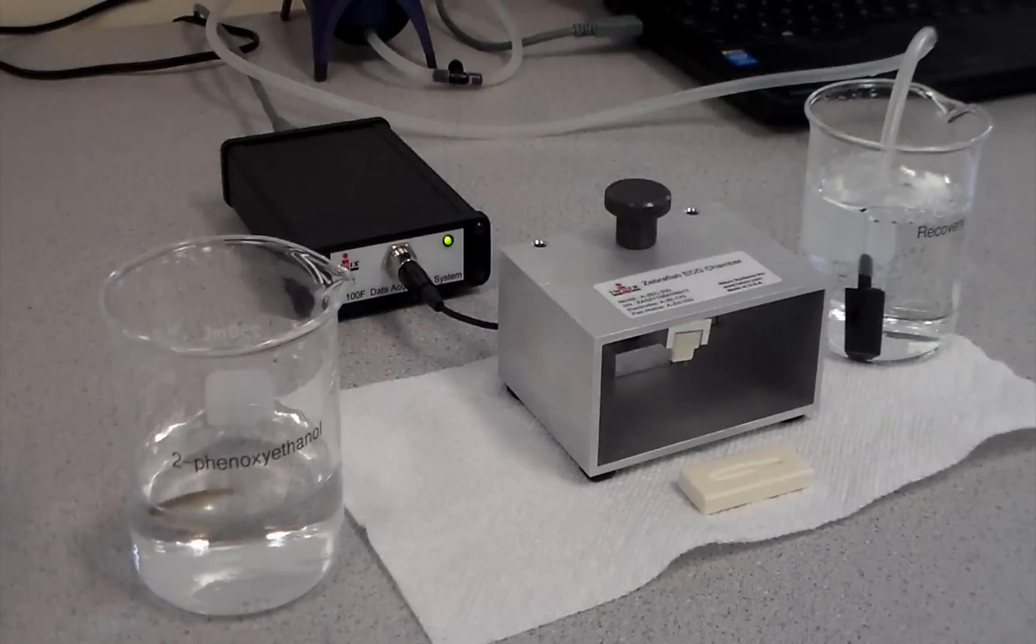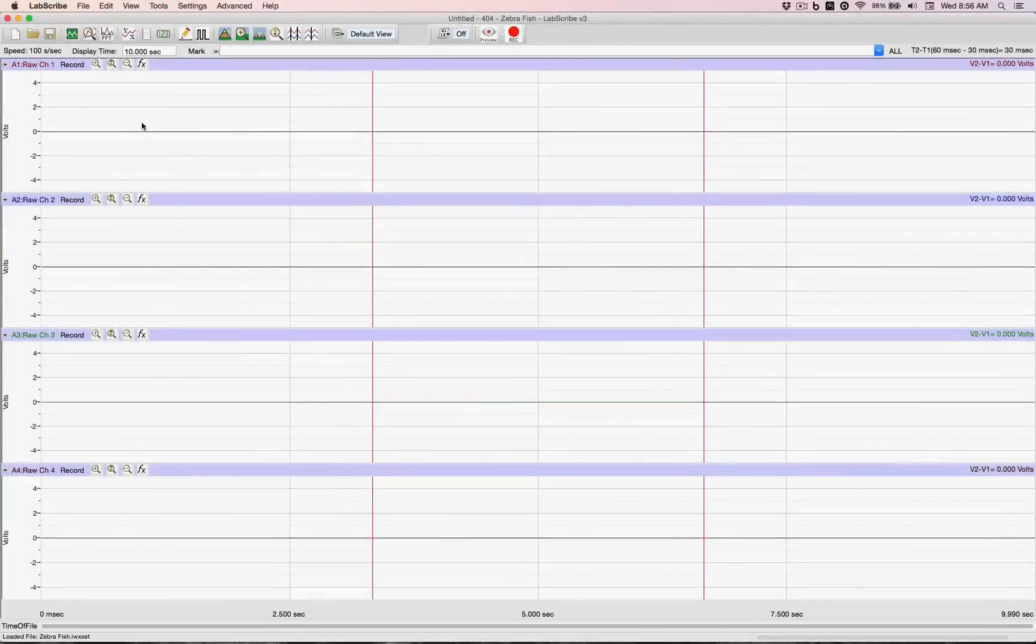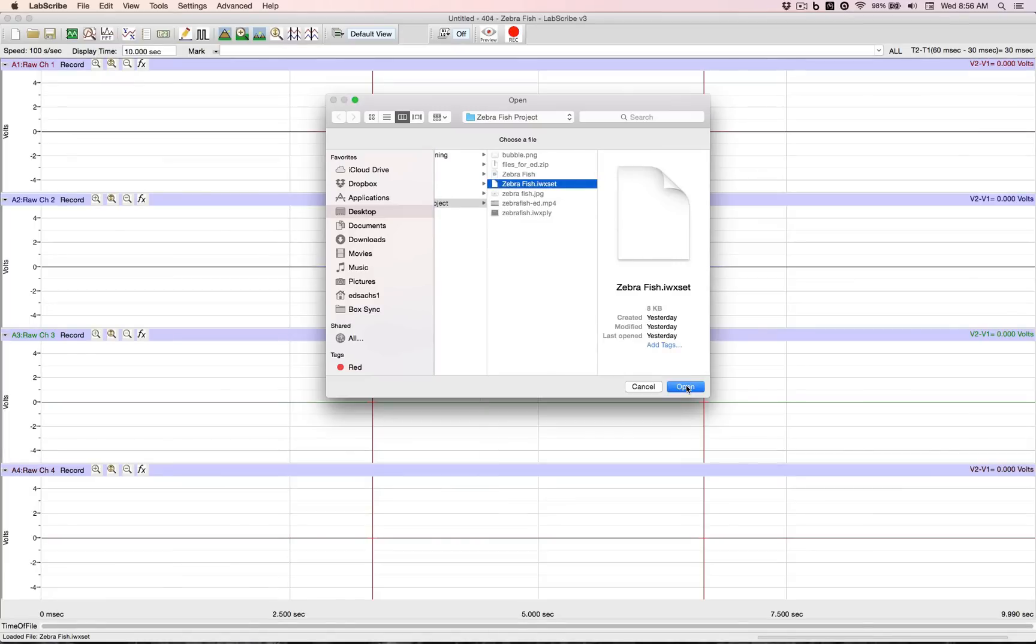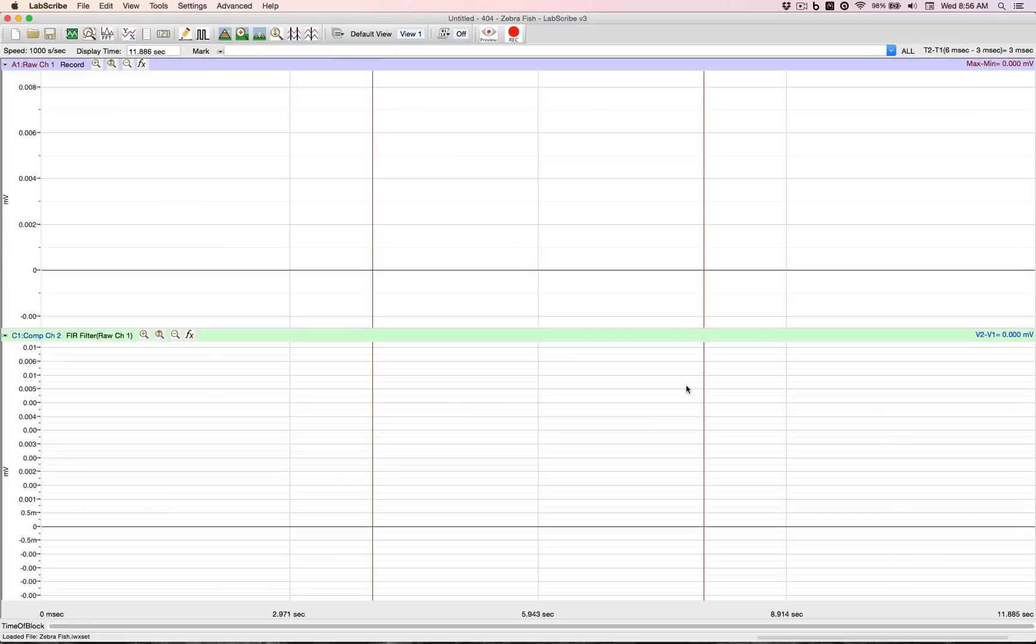While we are waiting for the fish to fall asleep, why don't we set up our software. Opening up Labscribe, we open up the settings file, which is preset for two channels, a raw channel and a filter channel.